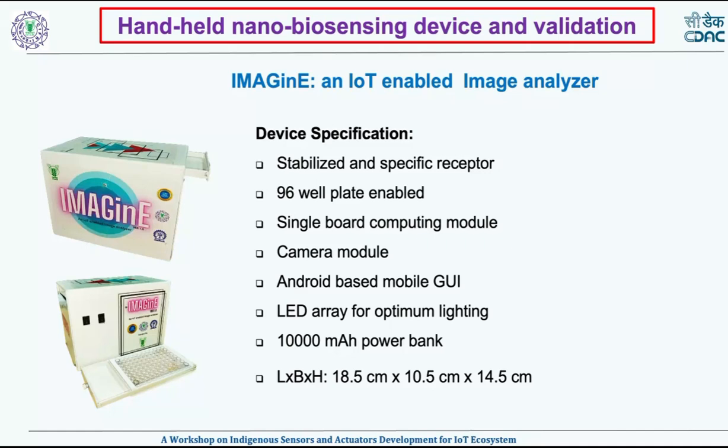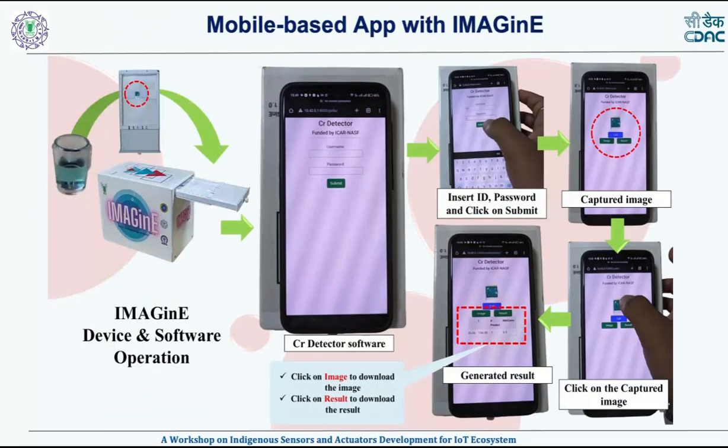In a spectrophotometer, light passes through the sample, and it gives optical density, transmittance, and reflectance. But here the color is being measured in terms of RGB, and based on this color, it gives certain signals. They have also developed a mobile-based app. If you give those data and standardize this algorithm, you can develop a linearity in this app. And if you go for an unknown sample, it gives you a result.